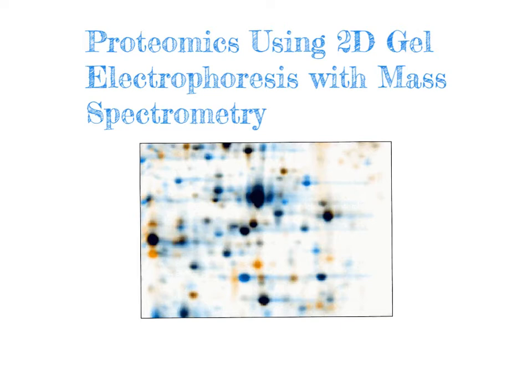And so the experimenter can then pinpoint which proteins are most evident in the treatment relative to the control. They can cut those particular spots, those particular signals out of the gel, and then use mass spectrometry to evaluate that particular protein in an effort to identify that protein and pinpoint differences between the treatment and control samples at the level of the protein.